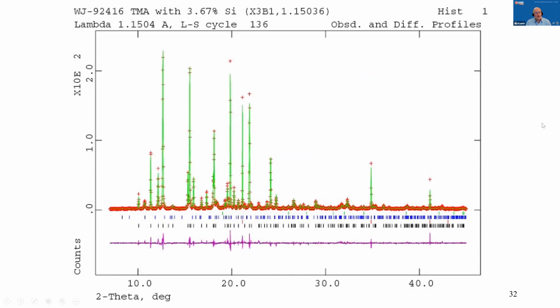So here's the Rietveld refinement, sort of doing this backwards. Here's the fit. There are 4 sets of tick marks here: one for the anhydride, one for a silicon internal standard, one for corundum from the micronizing mill that I used to grind it, and a 4th set of tick marks, which turn out to be trimelitic acid. Between the time we got this from Chicago to Brookhaven, where this data was collected, a little bit of this reacted with moisture in the air and hydrated and made the acid. It's an annoyance, but it's just another phase, and it's not a serious problem.